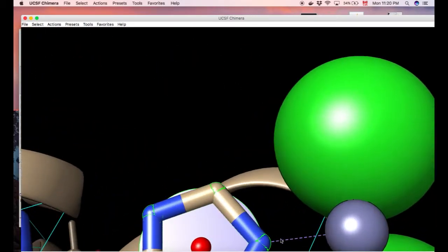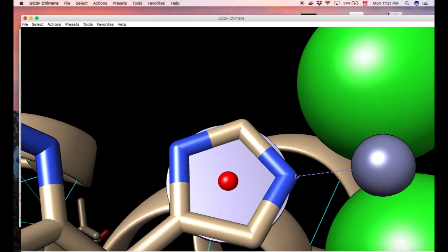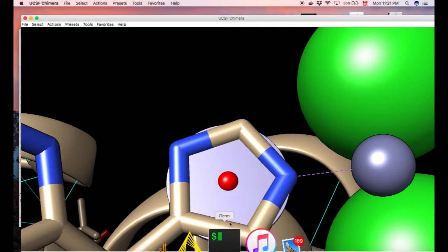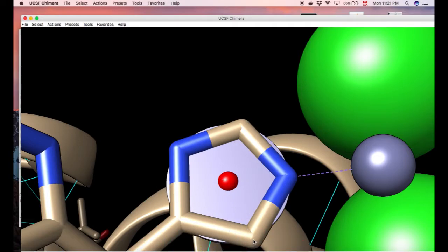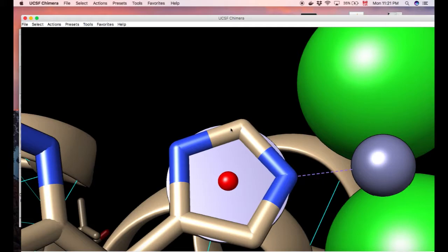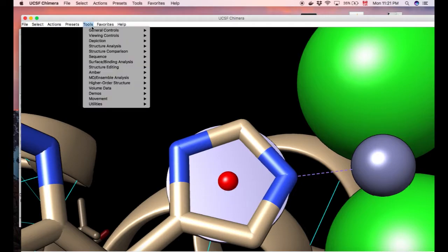For example, really quick reason. Let's say you have a drug and it has a heterocycle like this, and it's a little bit too big. So you calculate with a plane and it's slightly too big. One trick you can do is maybe add nitrogens in a way that would maybe squish it a little bit, because nitrogen, you know, have a smaller radii, or maybe you could have different strategies. Maybe add a sulfur group here and just maybe increase the size or decrease the size with different atoms and calculate always with this tool. That's an example.